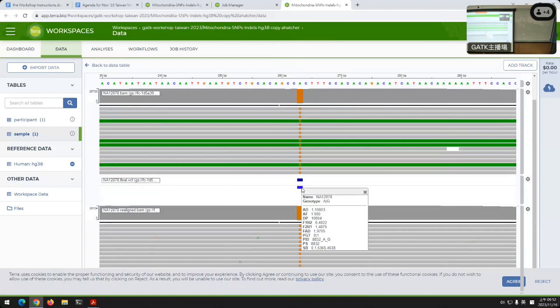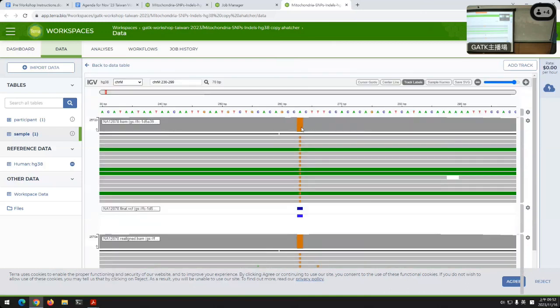You can also see the whole genotype is actually A and G. There's some phasing information there, the pipe means that. Look at the depth there. You've got a 10,000 read depth. Yeah, it's mitochondria, right? But the funny thing is, if you go up here to the original BAM and look at that site, you actually had 25,000 here. We actually downsampled a bit when we were making our call.